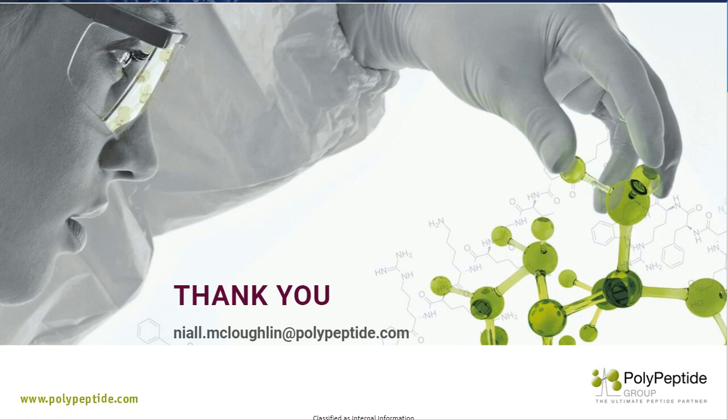So the criteria to determine coupling completion is our colorimetric test. Generally we perform a Kaiser test, which is very classic in peptide synthesis, for the coupling of primary amines. Or we'll also perform chloranil tests in order to assess the coupling of prolines. We take a small amount of resin, perform the test, and this is assessed under a microscope to see the color of the beads.